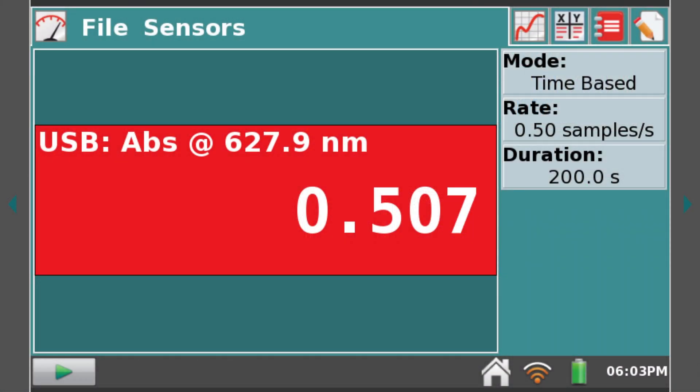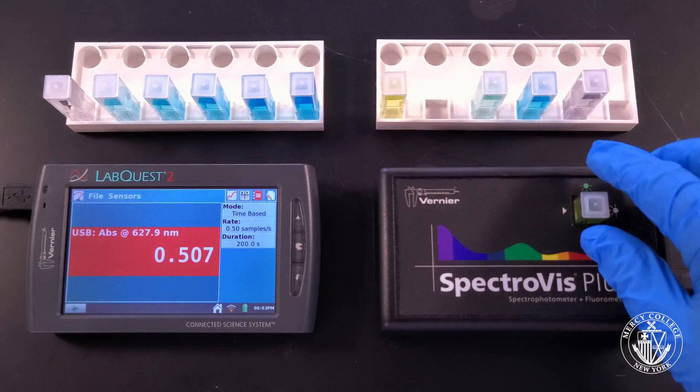Our second sample of fierce green apple appears to have an absorbance of 0.507.